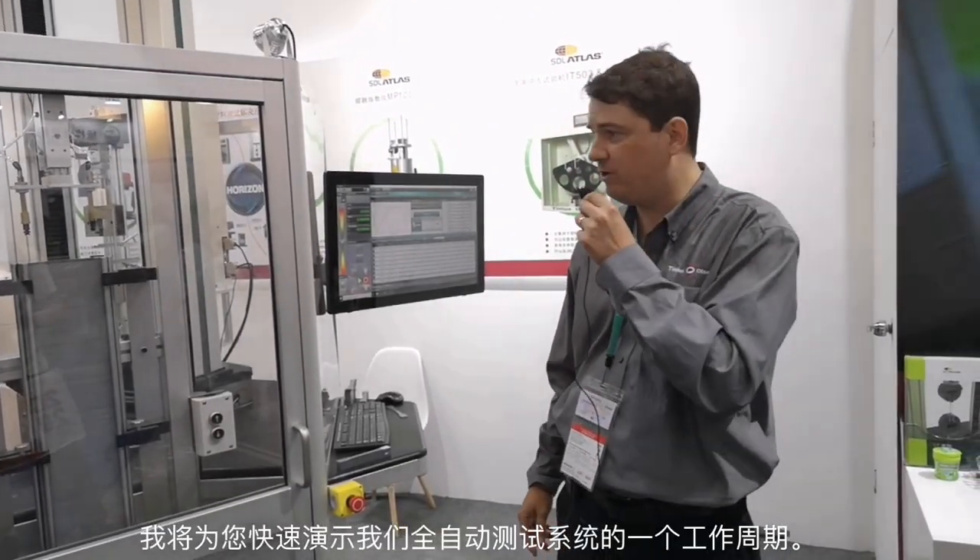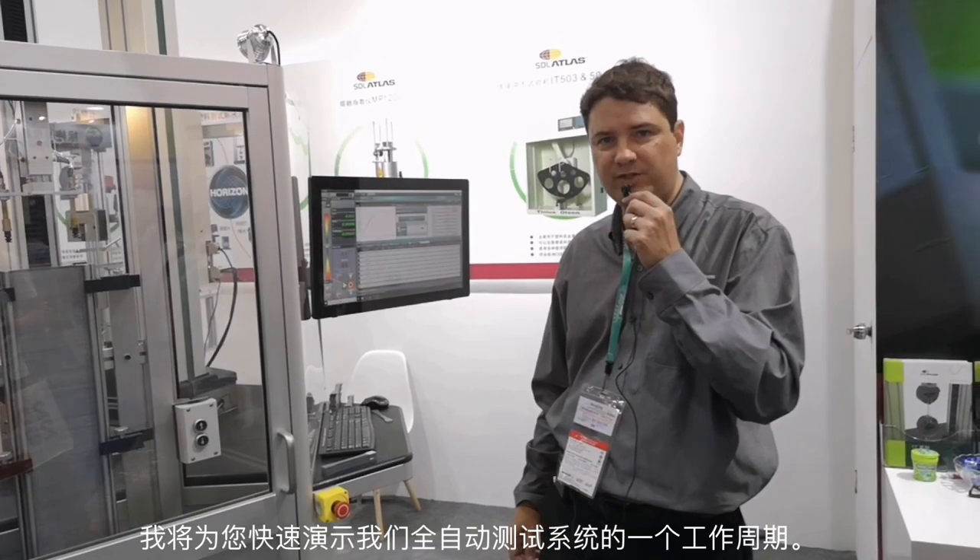Hello, my name is Rick Nielsen. I'm with the Research and Development Department of Teneus Olsen, and I'm going to give you a quick run-through of one cycle of our automation system.